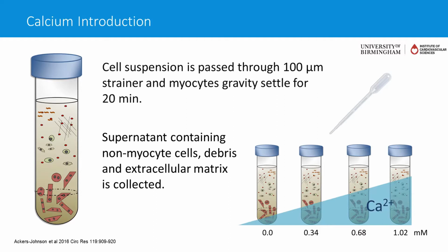We put in our paper 10 minutes for each settling, which usually works pretty well. But if they're settling more slowly or faster, say you have a very big pellet after just 5 minutes and that's all the cells you need, just go ahead with that. You don't necessarily have to wait for the full 10 minutes, because you don't want your pellet sat there becoming hypoxic. If you have enough cells, then just go with that.